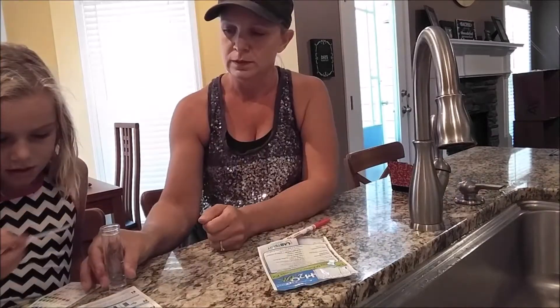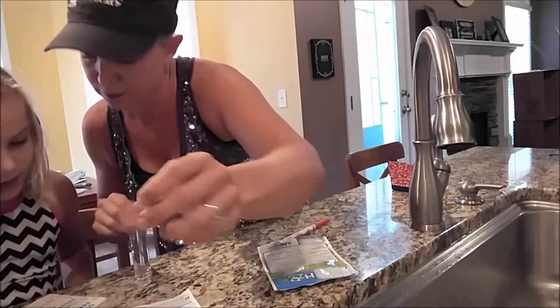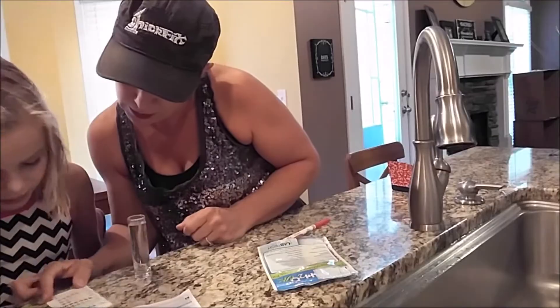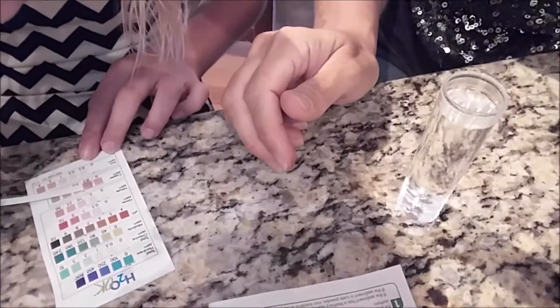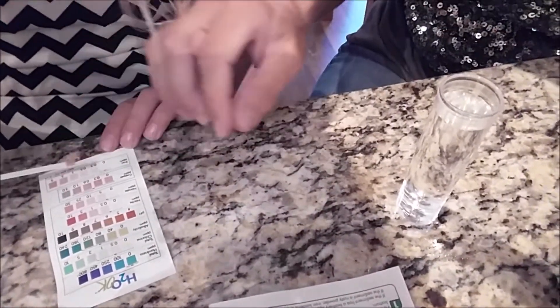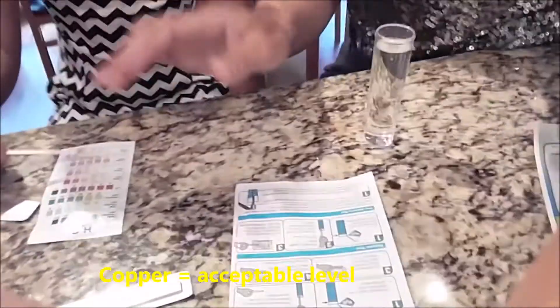Copper test. Wait 15 seconds. 15. What kind of counting was that? I think it's about 0.3. You think it's at 0.3? It says the copper levels are okay.